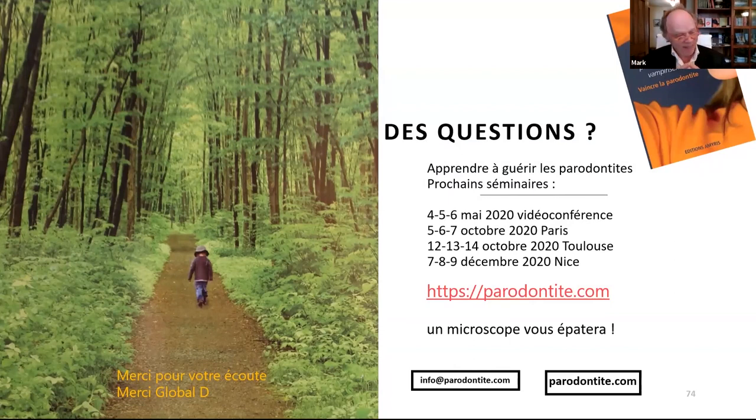Thank you for your question. Of course, it is very important to look for the microbiota of the patient on the different teeth to see what is going on in the sulcus. So the tool for this is a microscope. It's a phase contrast microscope. And we suggest you have 100 magnification. This is the one used to find most of the parasites, white cells, and make the difference between epithelial cells and parasites. You can see them very widely. And then we recommend you use 1,000 magnification.